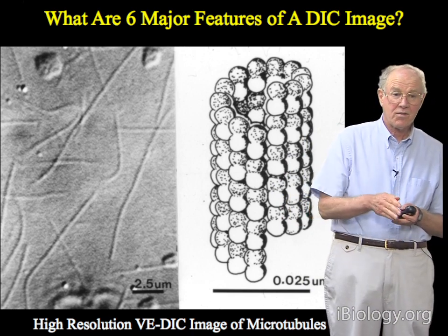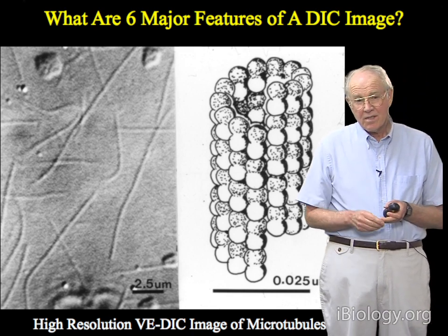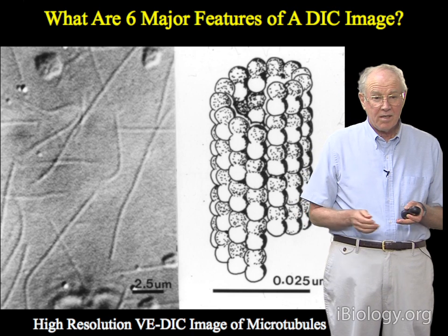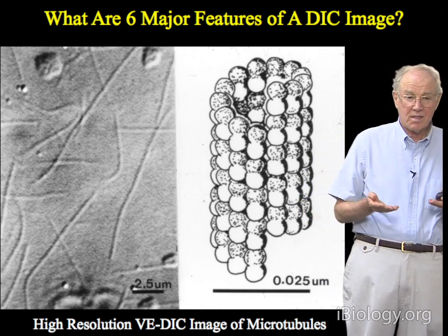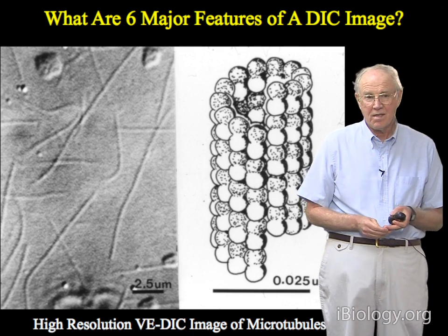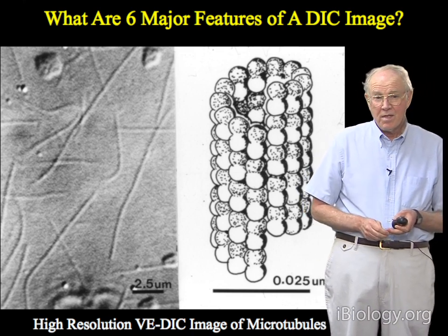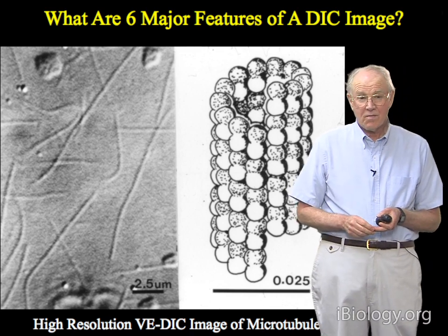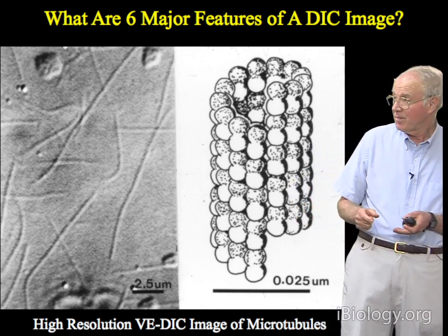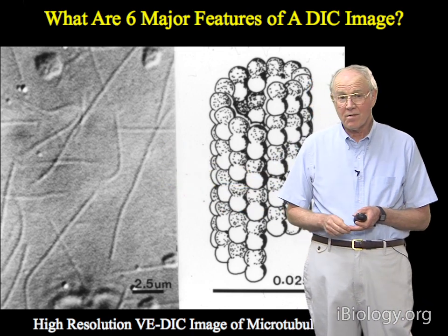It's the direction of highest contrast, right? And the brightness of the bright spot or the dark spot depends on how much scattered light is produced by the specimen, which depends on the protein density there, and that could be different for the different little tiny spots. The protein density for the microtubules is fairly uniform along the length, and so the image that you see for microtubules looks rather constant along the length of the microtubule.